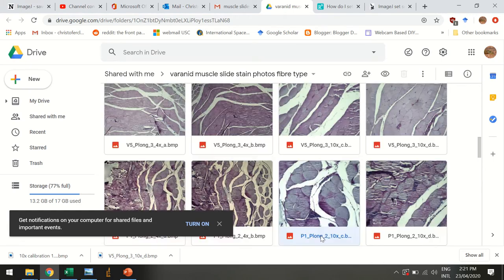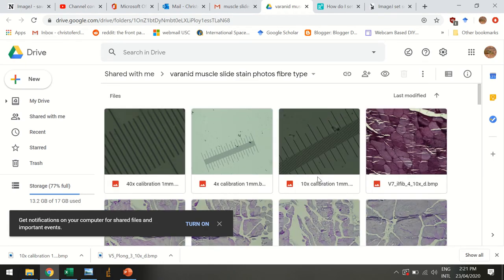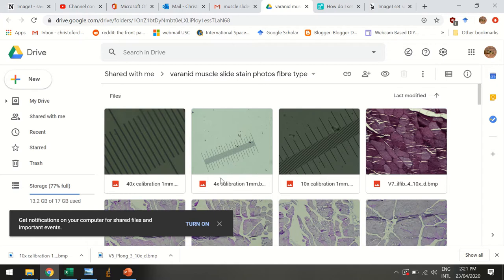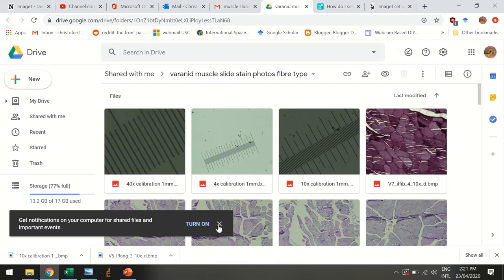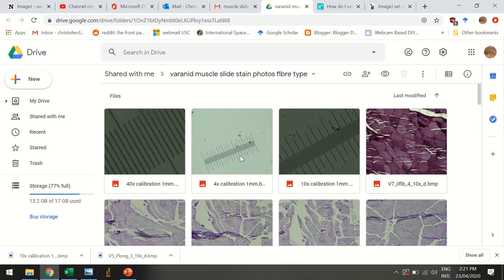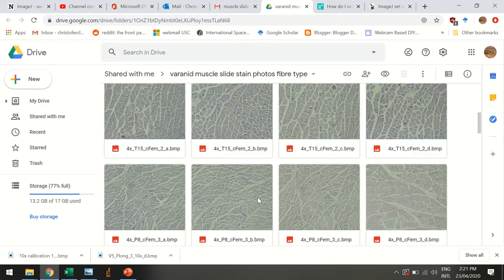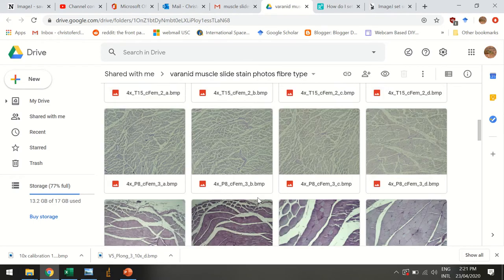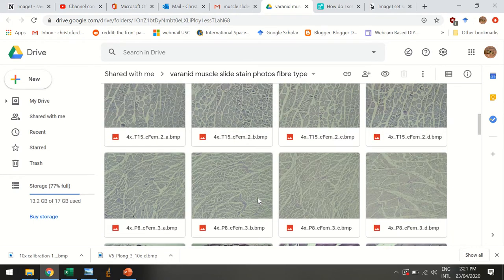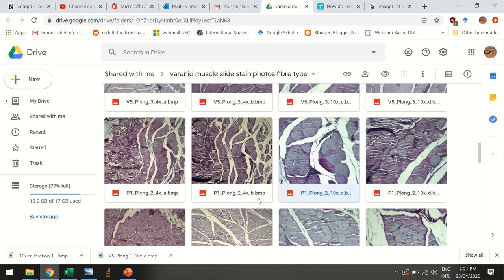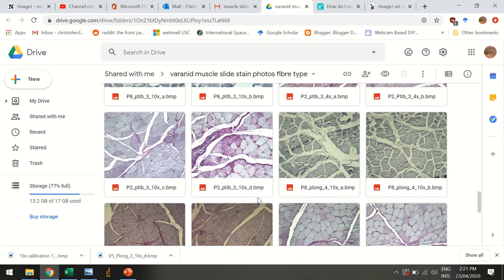When we took these images, we took them at different magnifications. We took some at four times magnification and they might be more useful for getting cell counts. Then we took some at ten times magnification and they might be more useful for getting diameters. I'm going to show you how to get diameters with ten times magnification, but the same process could also work for four times magnification if you want.